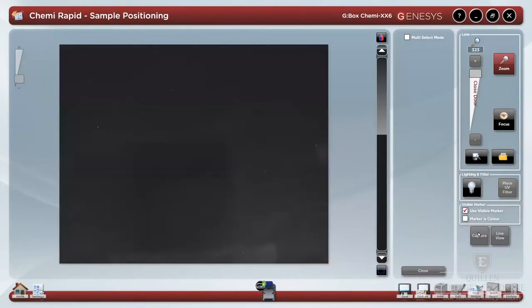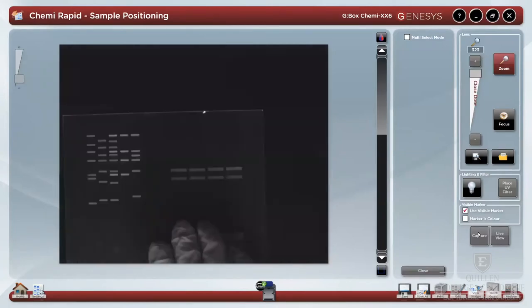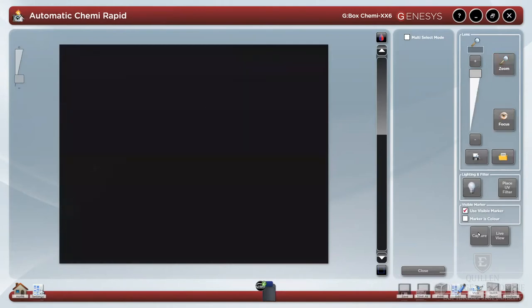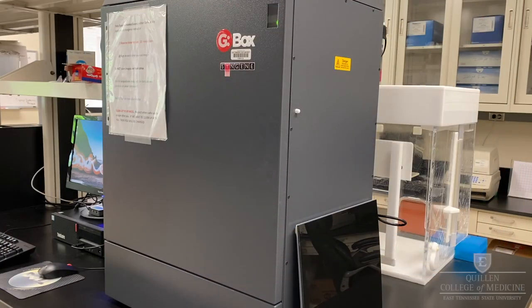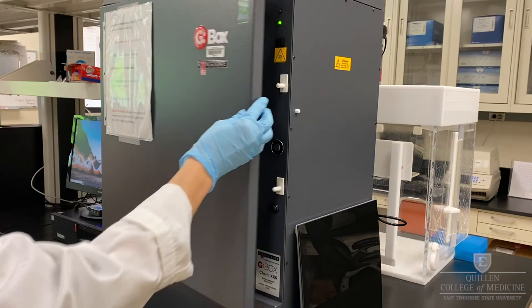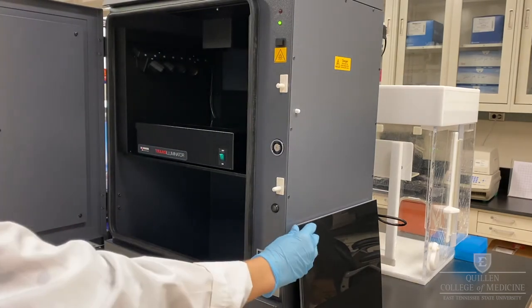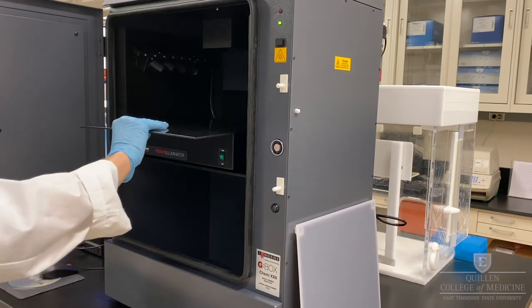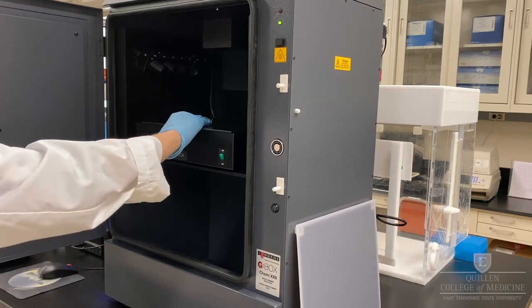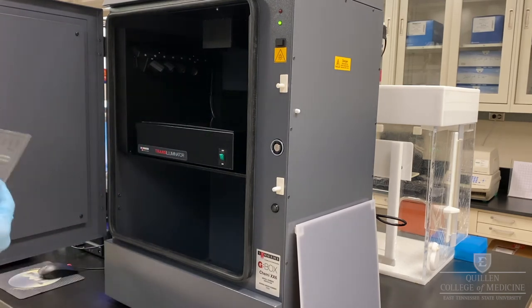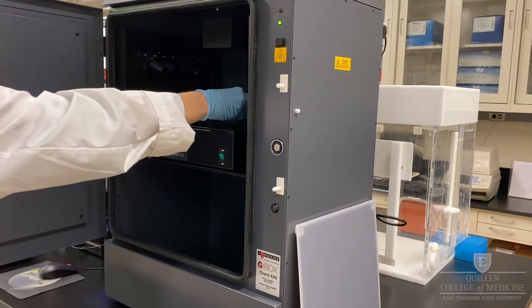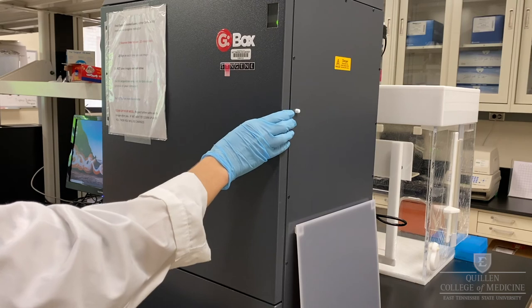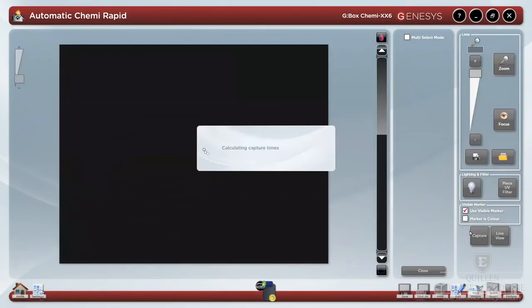You can then insert any needed anti-reflective screens and your gel or blot using the white light camera to position it accurately. The button to the right-hand side of the digital darkroom is used to open the door. Anti-reflective screens are found on the right-hand side on the countertop. Position your gel or blot using the white light camera, then gently close the digital darkroom door.